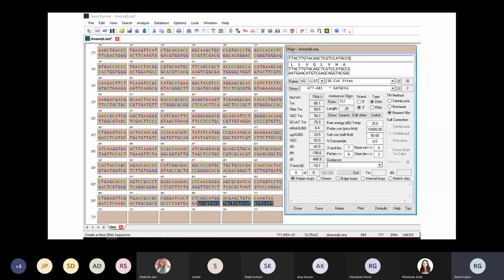Now coming to the reverse primer, carefully note that we have now incorporated the stop codon, because now we want the translation to get stopped, because EGFP is lying downstream to the MET30 insert. So we need to incorporate the stop codon while designing these primers. Hence, the stop codon has been included, and now you can see the primer which has been designed does not have any hairpin structures, and the TM values, if you note carefully, for both the forward and reverse primers for EGFP are comparable within a range of 3 to 4 degrees Celsius. That is essentially what we wanted. So now we have the primers for EGFP as well.